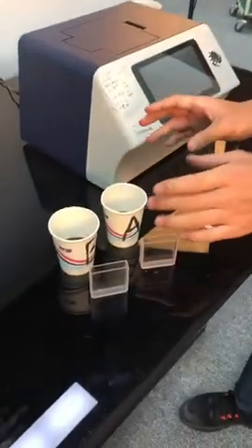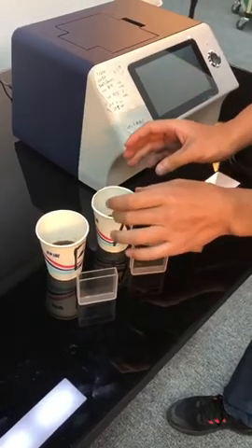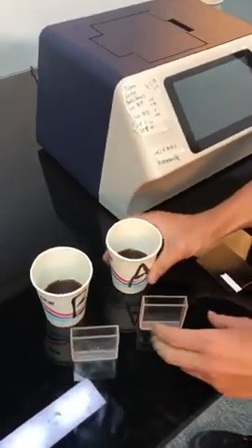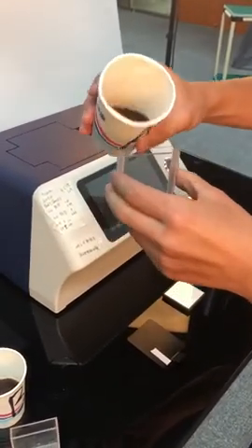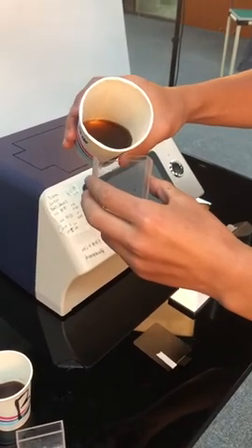Here we got two cups of liquid samples, sample A and sample B. First, we get the samples ready. Pour the liquid into the cuvette. Pay attention to do it slow and steady.